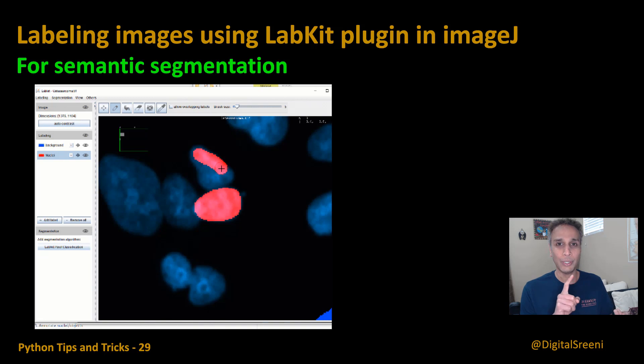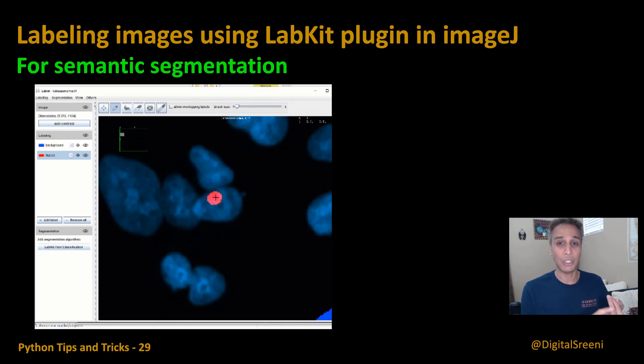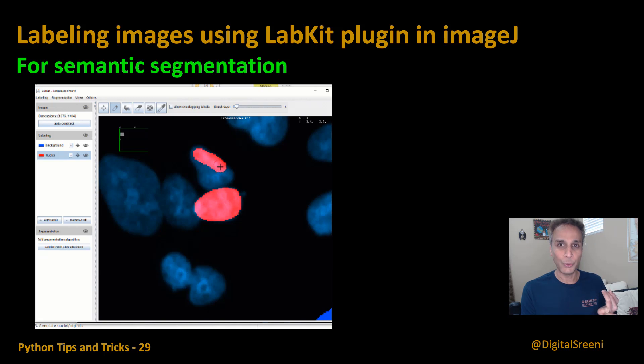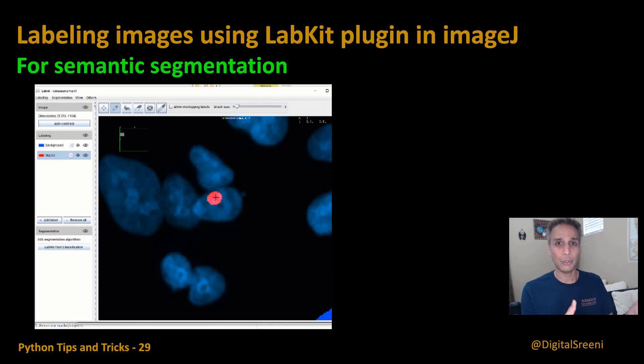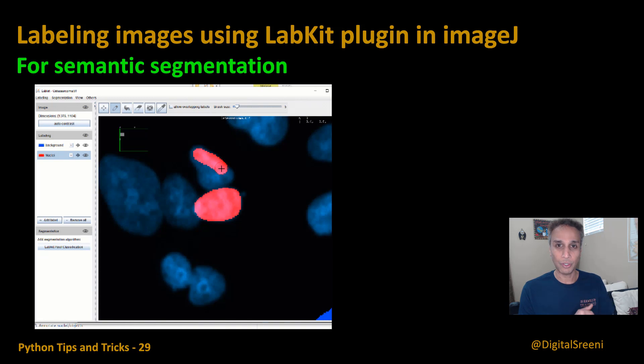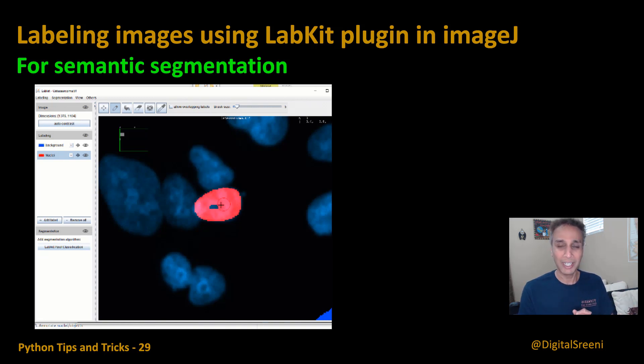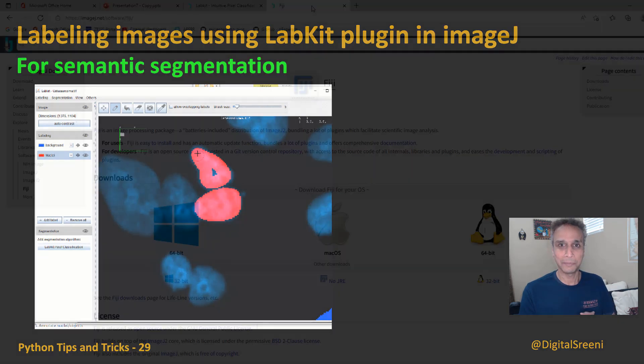I'm going to show you exactly where you can get your ImageJ, how you can install this LabKit plugin, and then how you can actually use it to label your images and download them for your machine learning purposes. It may sound like a long process but it is pretty quick so let's jump into it.